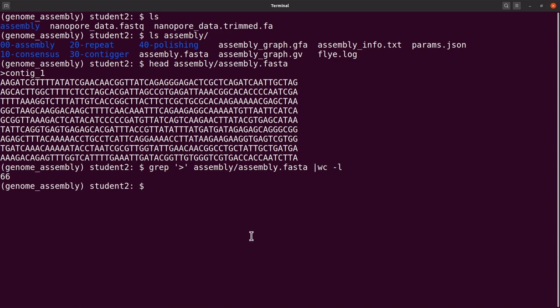That's how it is, but it's fine. The purpose was just to get the genome assembly done, and now we have what we need here. We also did some polishing, so it has been very good. I believe this has been helpful, and then you can now proceed to do your other stuff as well.